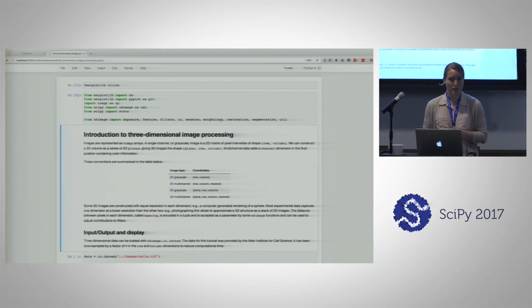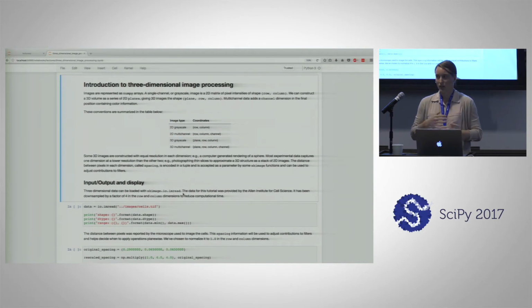At its simplest, a grayscale volume is a 3-dimensional matrix. In practice, 3D images aren't pure volumes, and this is largely due to the way that they are captured. In the cellular data that we'll be looking at, the microscope imaged the cells by changing the focal depth, generating that stack of 2D images where one image was taken here, another one was maybe taken here, and so on throughout the stacks.